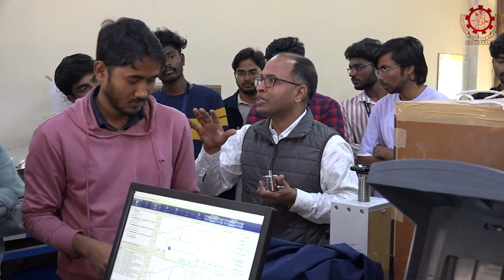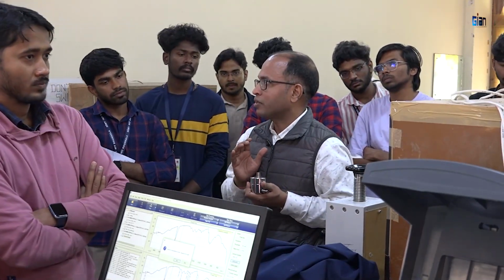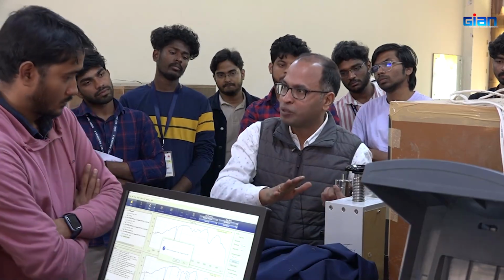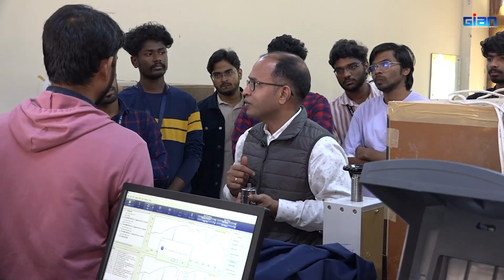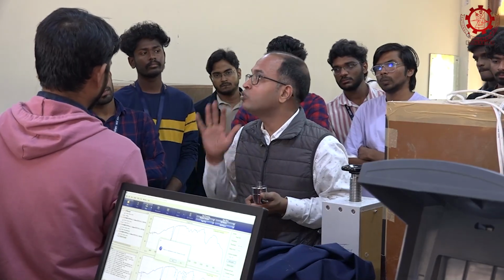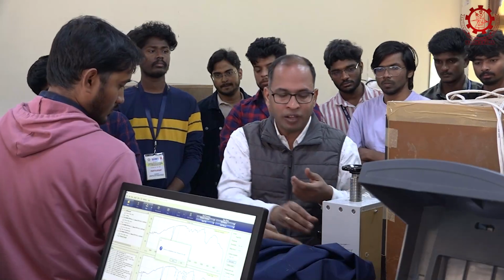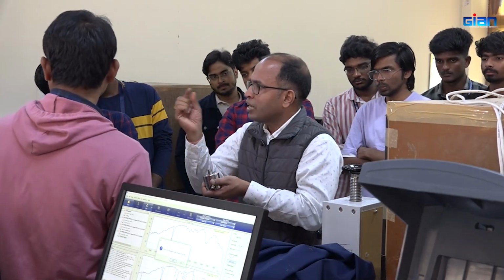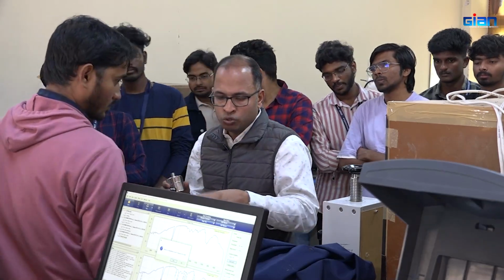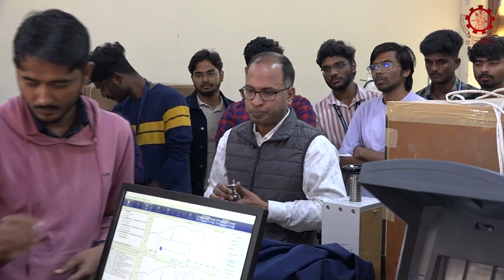I think if you understand, this is a simple thing, but to make that film a good quality one, all these techniques have been used. Maybe you can press with your hand, that might work, but just to have it very, very uniform, this pressure is applied and we get the film, and then you take this out, you remove this one, and that film you use. We have the sample holder.